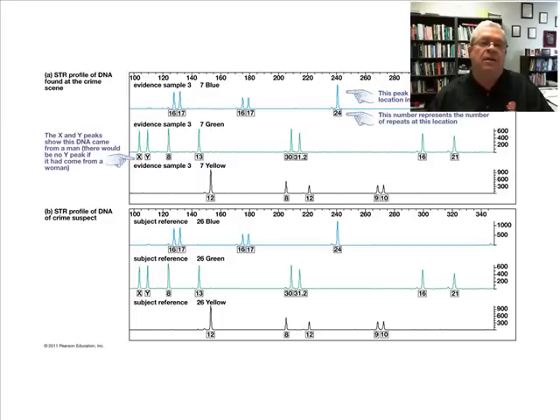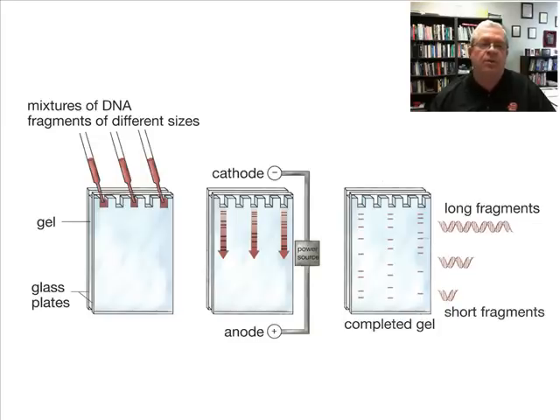But what I would like to do is explain it in a simpler way. These techniques have evolved over the years. They're quite fancy now. If you get into this, you'll learn the fanciest techniques. I would like to explain it in simple terms, using what we know about gel electrophoresis.